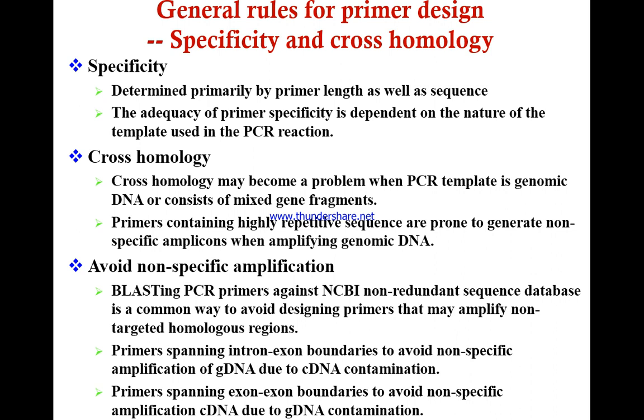So before going to the wet lab, we go for the in silico lab, and we can BLAST our primer sequence against databases. It will show us how much non-specific amplification can occur, so we can make changes to our primer and avoid it.